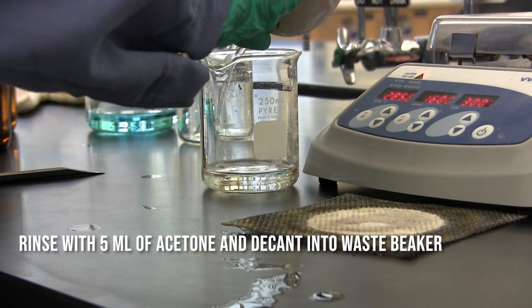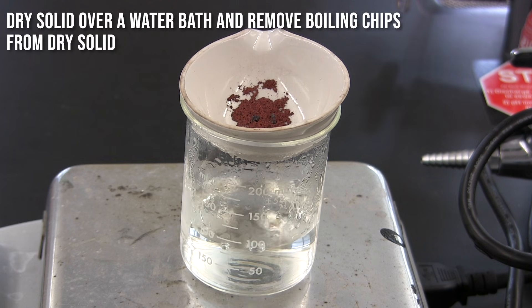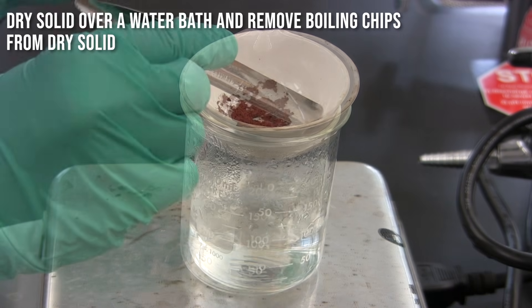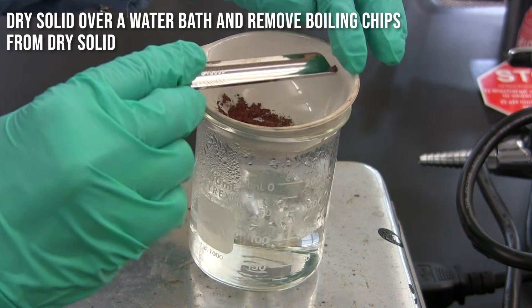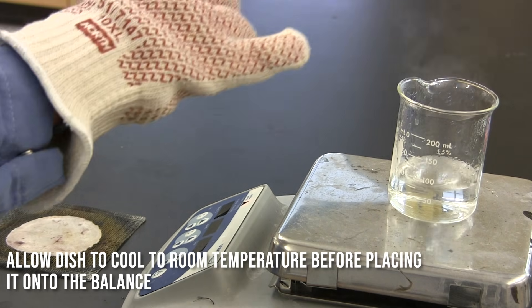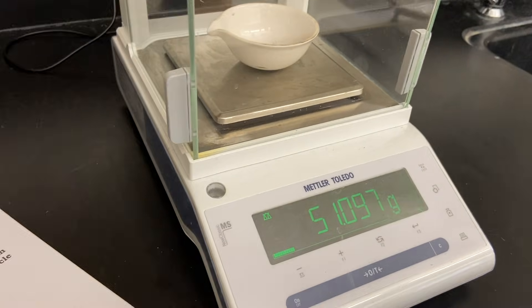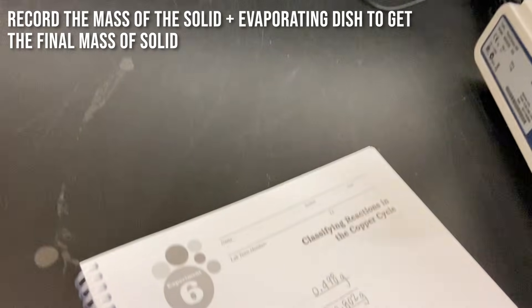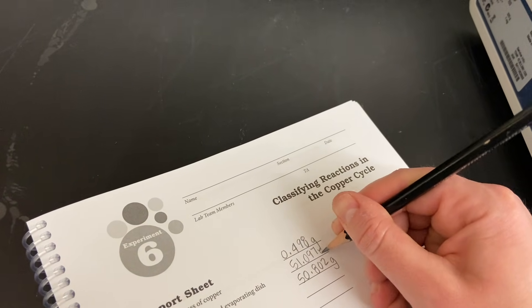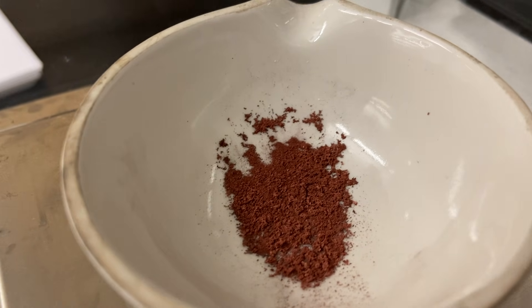Now we're going to place the dish on top of a water bath and let the solid dry. Once it's dry, make sure you remove the boiling chips, then place it onto a wire gauze to cool to room temperature. Once cooled, place it on the balance and record the mass of both the solid and the evaporating dish together. And that's our final product — that's our copper.